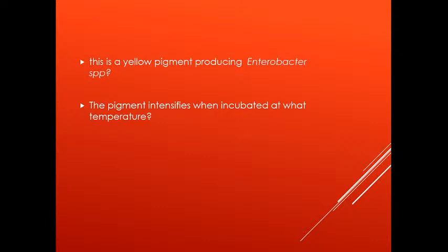Hey, this is actually very funny. I've encountered this organism in the clinical laboratory many times now, and they don't produce a lot of pigmentation when initially inoculated. Especially when you just take it out of the incubators, it's not a special color of yellow.